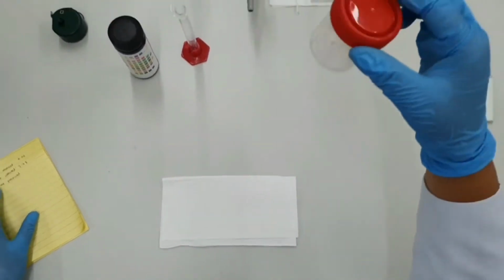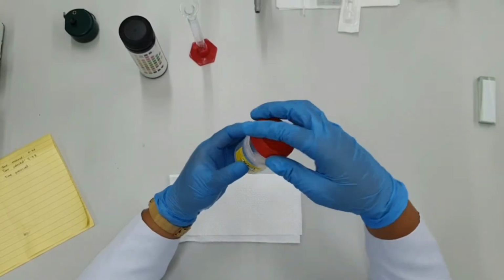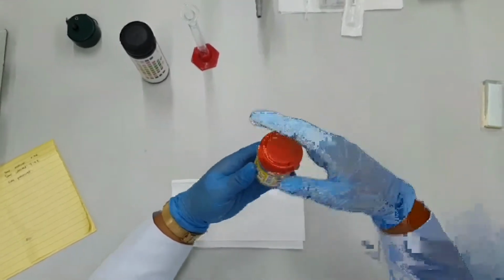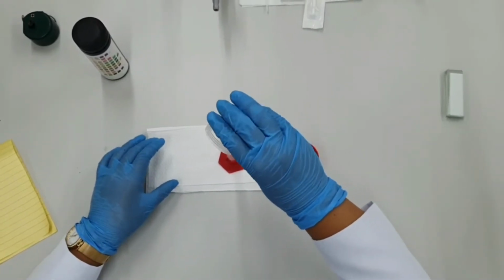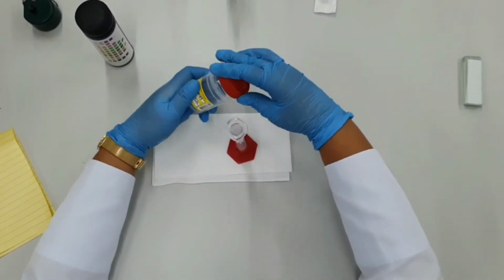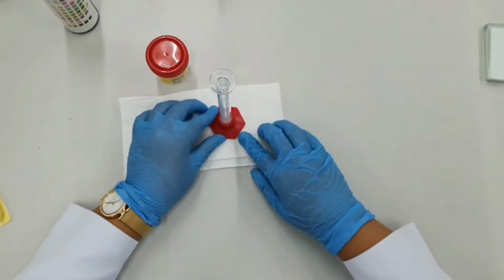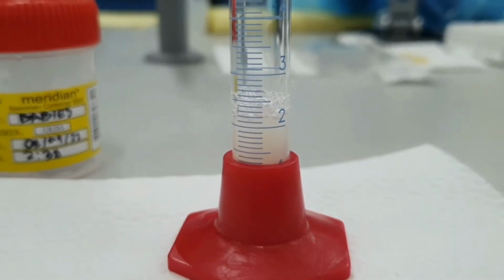Now, measure the semen volume using a graduated cylinder. Transfer the sample from the container to a graduated cylinder. The semen volume is 2.2 ml.